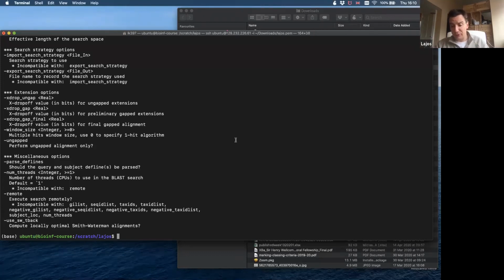So if you try to find a homologue for a completely unknown gene, let's say you are isolating a bacteria colony, sequencing, annotating with Prokka, and then you find that the genes you are interested in are annotated as unknown function genes, don't start looking for DNA homologues.